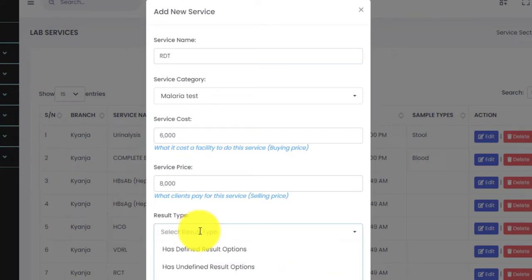There are various result types. We have those which have defined results, those which have undefined result options, those which read from machines, those with parameters, and culture and sensitivity.